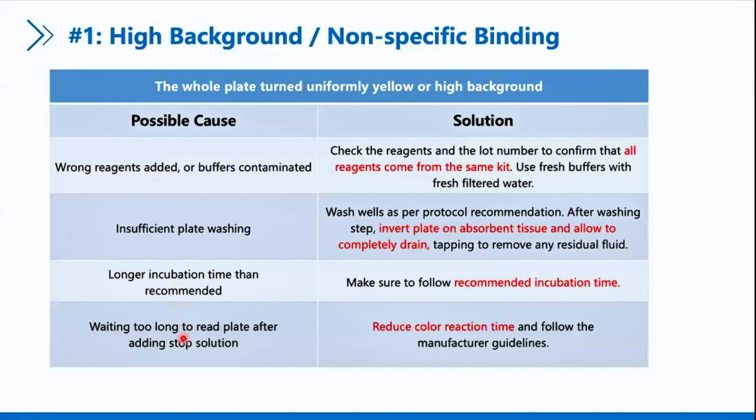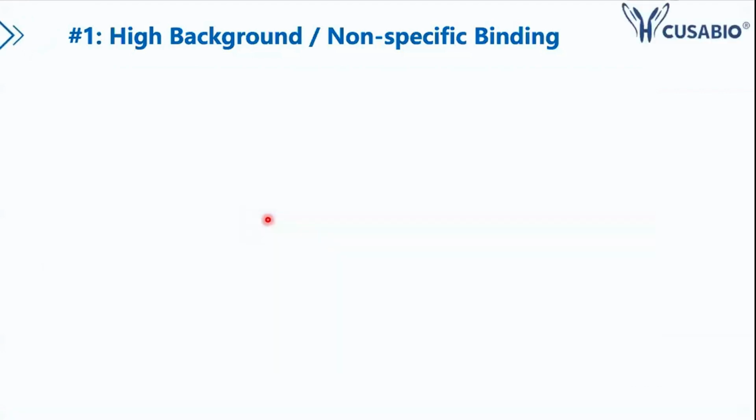Too long a reaction time will result in increased background signal, so inaccurate final readings will be obtained. All this will affect the final reading.